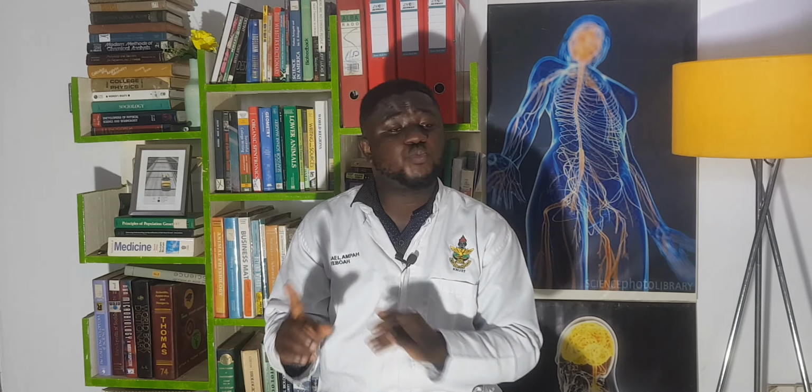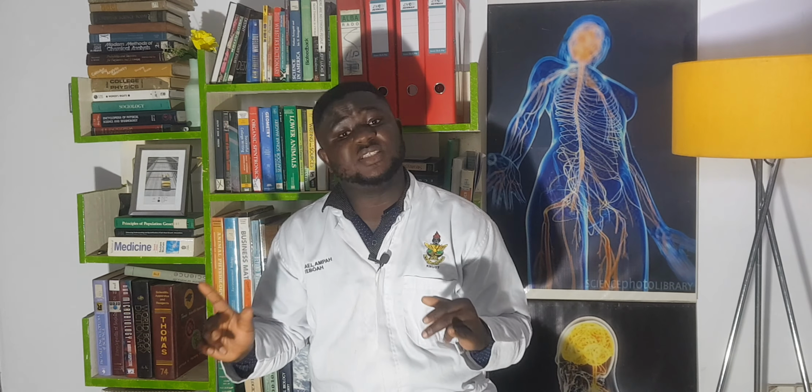And the visible spectrum, which has a longer wavelength, does not have all the harms that are associated with UV light. And so this new light that comes from the specimen can pass through our glass lenses. It is visible to our eyes and it's not carcinogenic. And so this is how the principle of fluorescence is exploited to eliminate all the harms that are associated with the UV microscope.